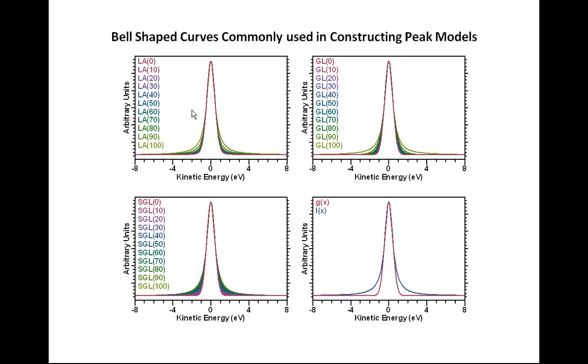And then secondly, there's the Voigt function, which they both try to approximate, and the smoothness of movement between the Lorentzian shape and the Gaussian shape is much better, and it does something else. It tends to produce some Lorentzian type curve even for the more Gaussian shape. So this is a better way of approximating peaks that are essentially Lorentzian.